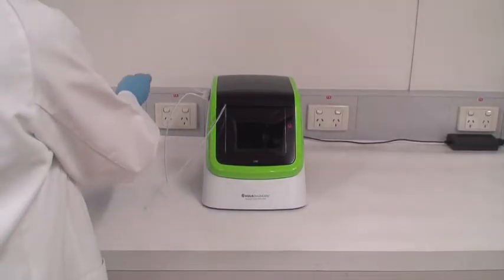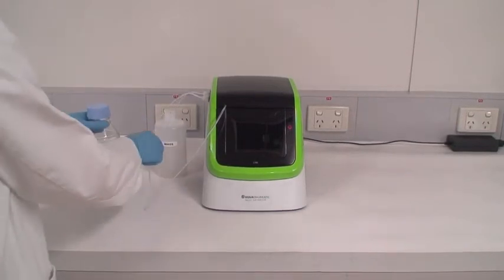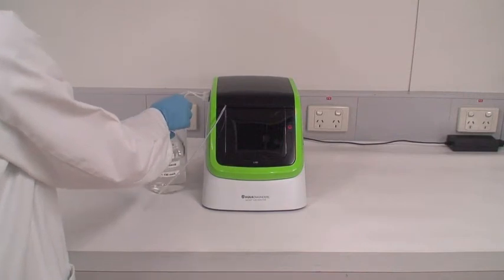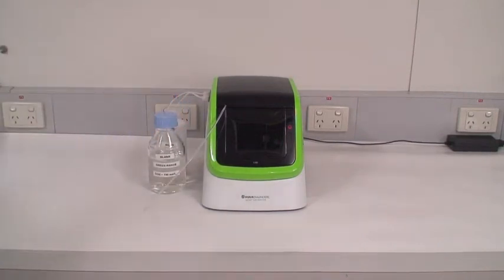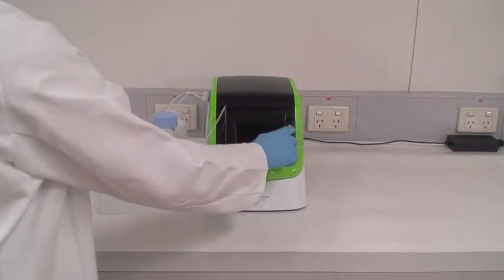Place the waste container at port W and place the blank solution at port B. The blank solution is made up of COD free water and PCOD electrolyte. Switch on the L100.